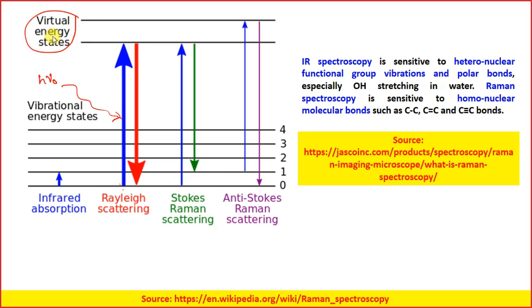Then most of the electrons will come back to the ground state having the same frequency.